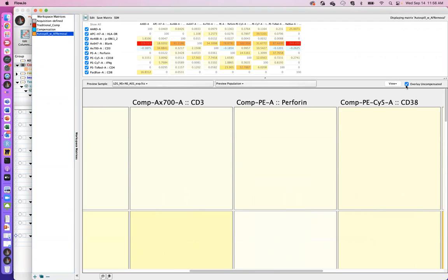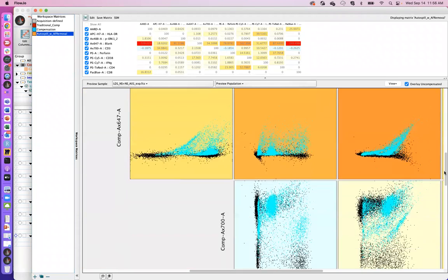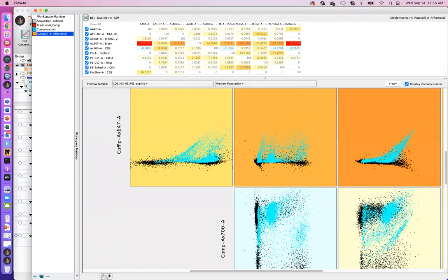If you actually look at the autofluorescence though, and we go to that channel, right, here's your Alexa 647, you're looking at the autofluorescence, right? You can see some cells here tend to be fairly bright. There's not too many of them, but when you do the autofluorescence subtraction, you can see that it flattens out those cells, right? Makes them more parallel to the axis. And in here, you kind of see that spreading.